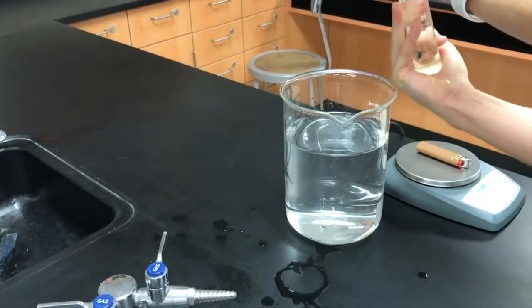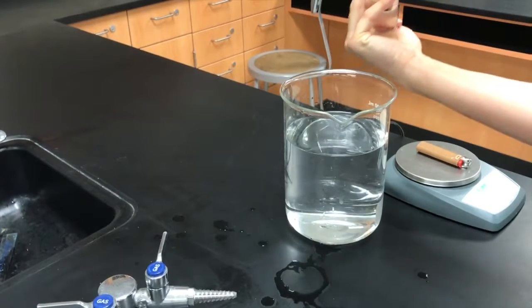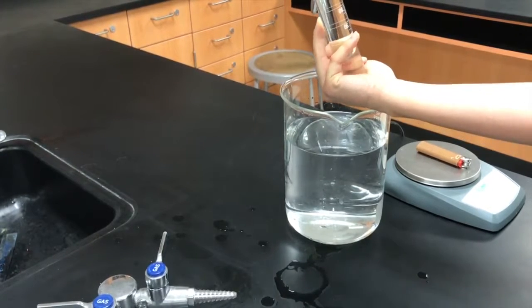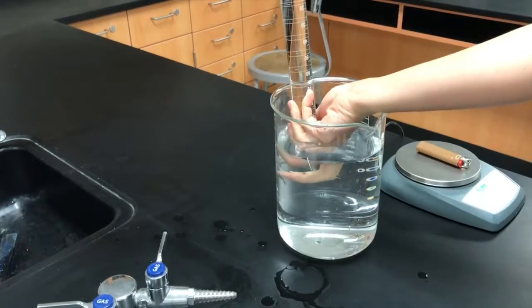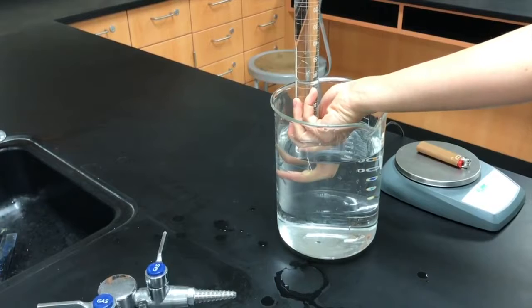Okay? So I would recommend having a partner actually tip the large beaker. Okay? And notice I'm using a 2,000 ml beaker. I don't have many 2,000 ml beakers, so you might have to use a 1,000 ml beaker. You'll be okay. And you're actually going to just invert it in there. Now notice I didn't do a great job here. I've got a little bit of air bubbles there. So if that happens to you in the lab, take this out, redo it again until you get almost none, if not no air bubbles.